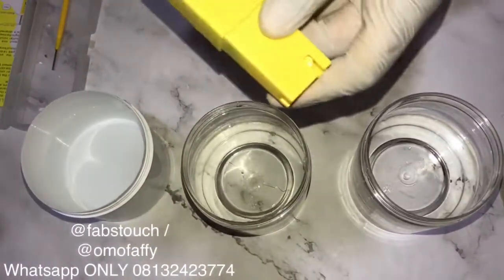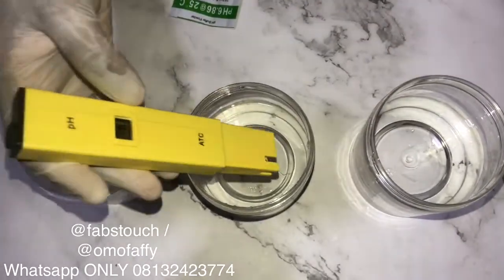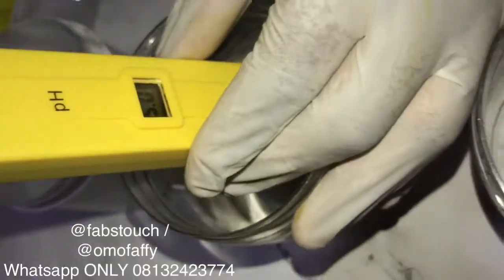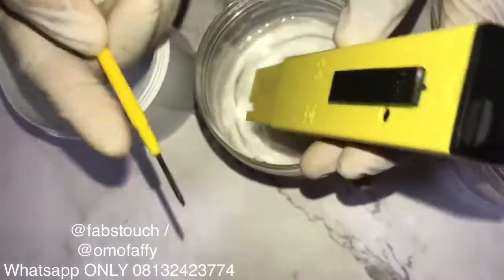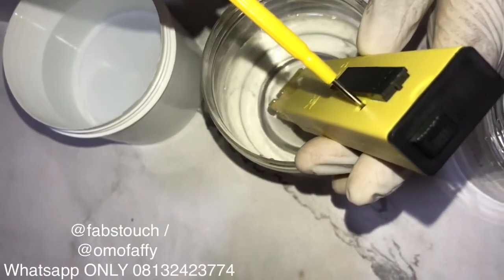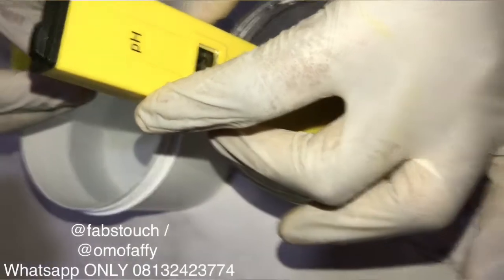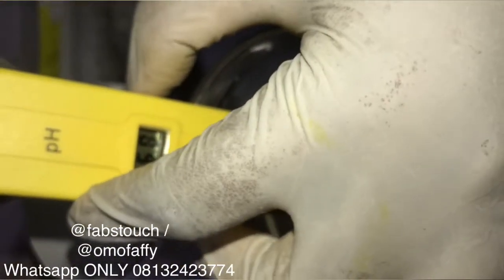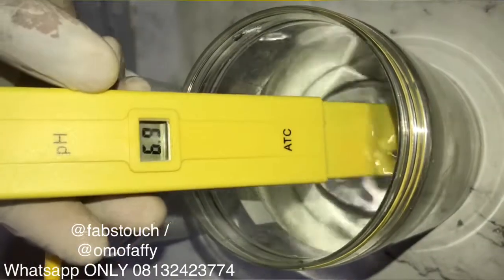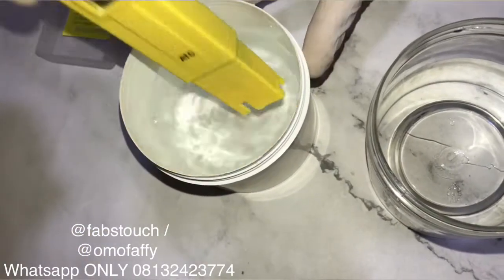Now you want to switch on your pH meter and dip it into the first solution — the one that has 6.86. A screw also comes with your pH meter. You dip your pH meter into the solution, and there's usually a space behind the meter where you insert your screw and calibrate it until it gives you the exact figure on that buffer powder. In this case the figure is 6.86, and we'll be approximating it to 6.9.